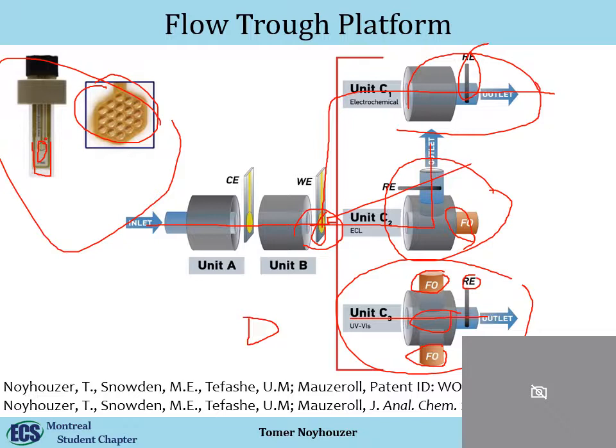In this case, this was my electrode. And again, if I have bubbles, they will get stuck in one of those small ones. But if you flow fast enough, the bubbles did not get stuck, and they cannot block the reference because the reference was just a wire that sticks into the tube. So if it blocks part of it, it still doesn't damage the measurement.